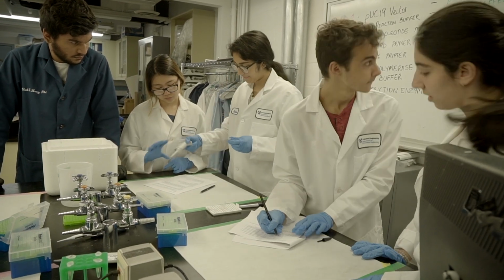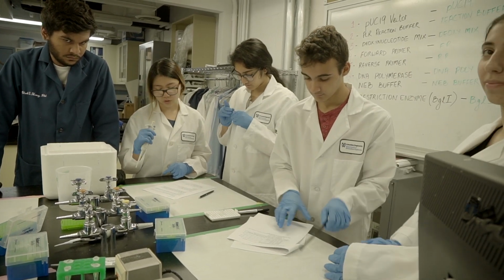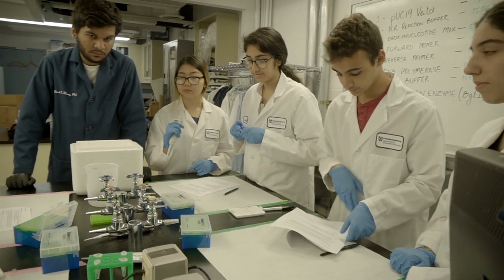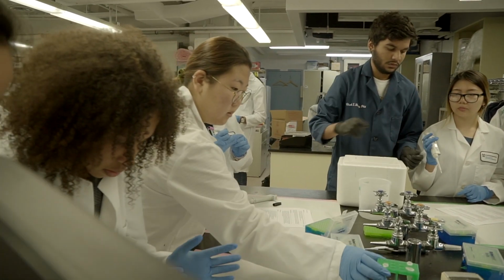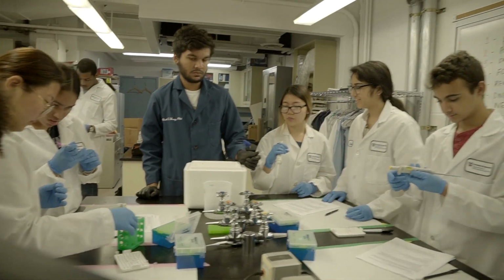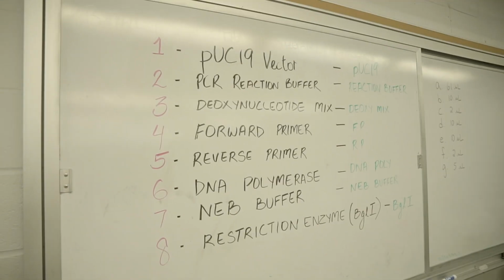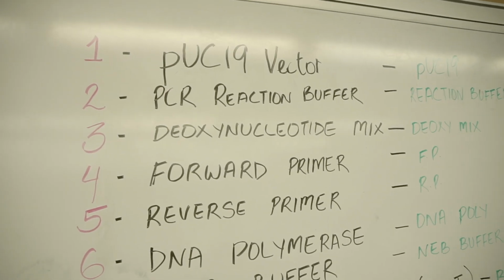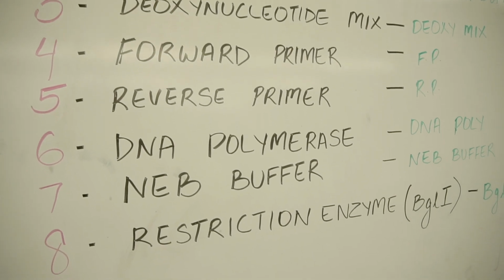Okay. Does this look familiar to you guys? So what's the total final volume? If the final reaction is 100 microliters, each amount is on the board, A through G. I recommend filling it out on the protocol as well, so it's easier to follow along. This is your water. And how did you guys do this already? Okay, perfect. So 61, and then it should be 10 for me. Has everyone written the values on the board into the protocol?